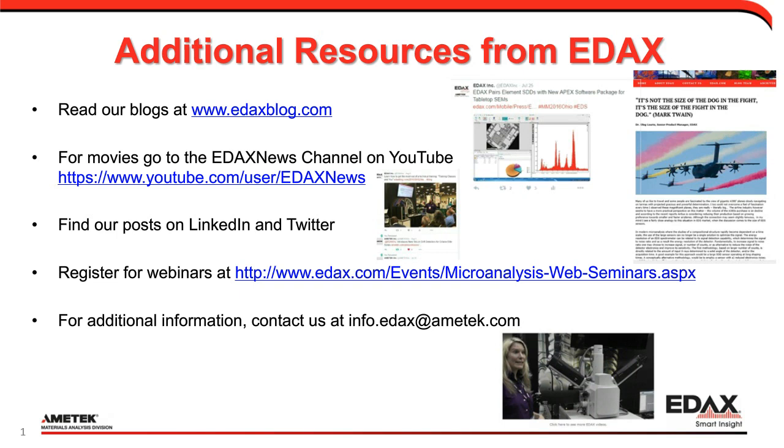How often do we need to do an energy calibration? That's a very good question. With Si(Li) detectors, changes in environmental conditions, the temperature of your room, maybe some electronics interference, used to mean that energy calibration was advised every month or so. With silicon drift detectors, we're much more stable, with the ability to correct for small changes.